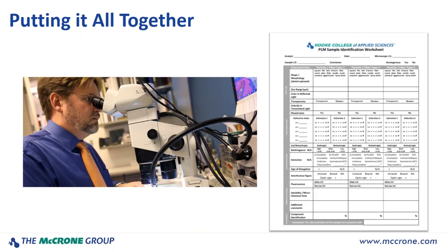The scientists at McCrone Associates use a data sheet to gather observations as they work on projects for clients in a myriad of industrial applications using polarized light microscopy. Each of the five methods presented here can be found in this document. There are additional characteristics, but these five form the foundation of polarized light microscopy.